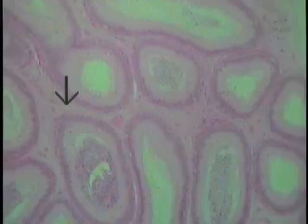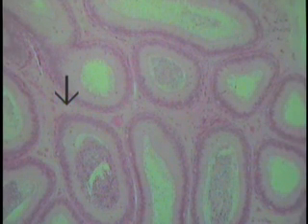This is a section of the epididymis, a portion of the male reproductive tract, its excurrent ductal system. Examine it for another form of pseudostratified columnar epithelium. Examine some of these tubular profiles where the epithelial lining will be found at increased magnification.